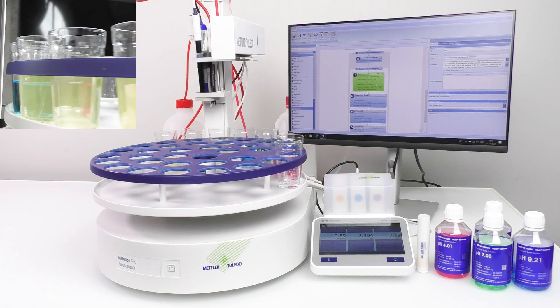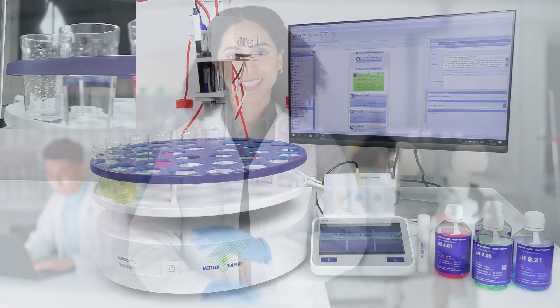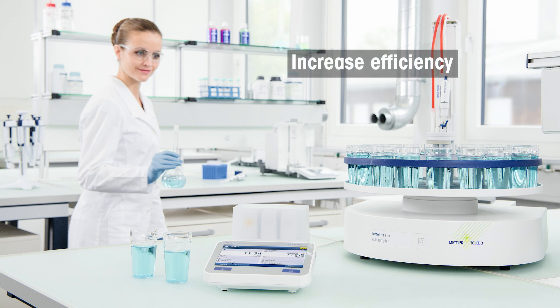Say goodbye to the tedious and time-consuming task of analyzing multiple sample parameters manually, and get ready to experience hassle-free measuring with Mettler Toledo's 7 Excellence and in-motion auto-sampler. Go ahead, increase your productivity, record your readings, and get ready to measure happily.